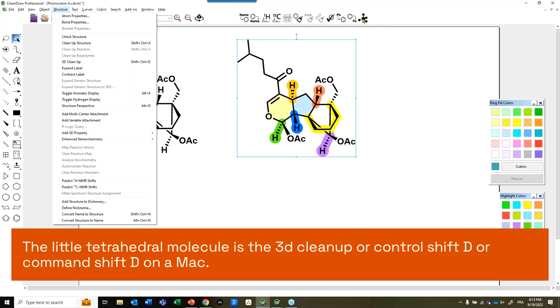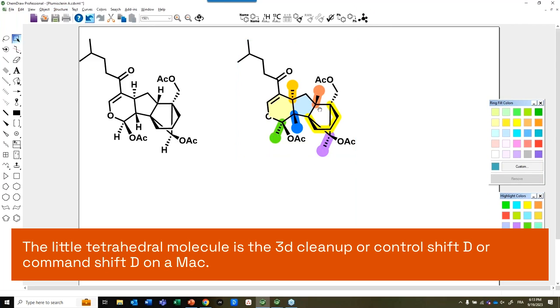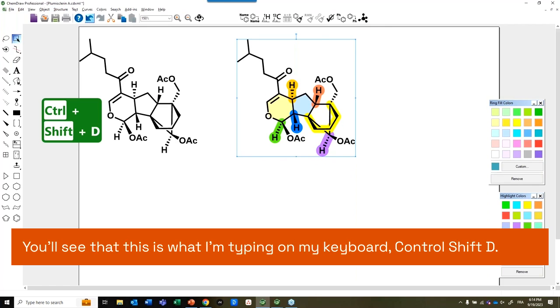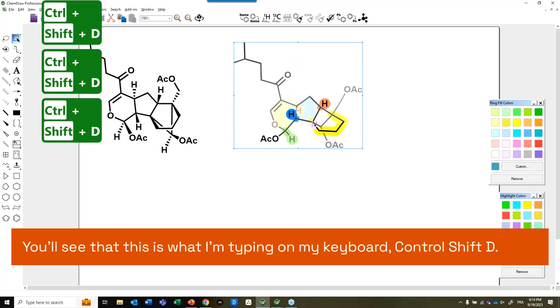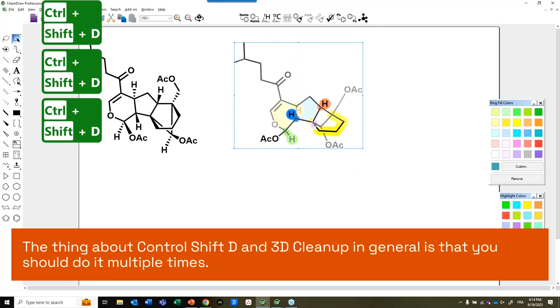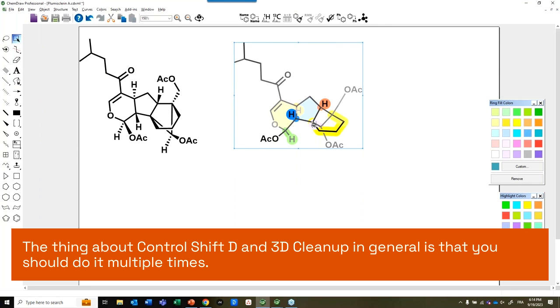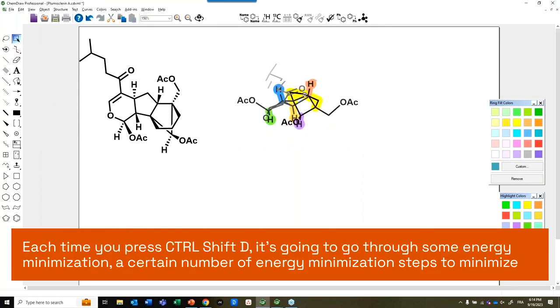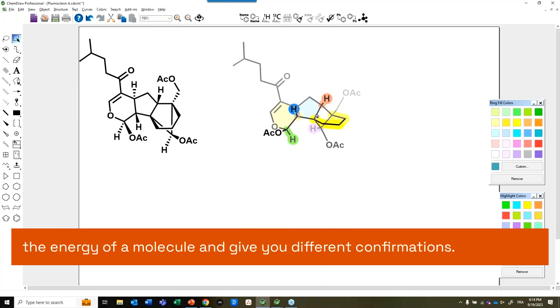It's available under this icon right here, the little tetrahedral molecule is the 3D cleanup or Control-Shift-D or Command-Shift-D on a Mac. You'll see that this is what I'm tapping on my keyboard, Control-Shift-D. The thing about Control-Shift-D and 3D cleanup in general is that you should do it multiple times. Each time you press Control-Shift-D, it's going to go through some energy minimization, a certain number of energy minimization steps to minimize the energy of the molecule and give you different confirmations.